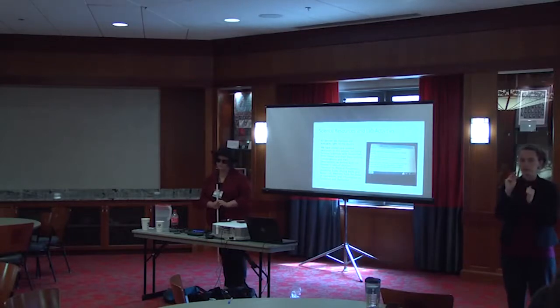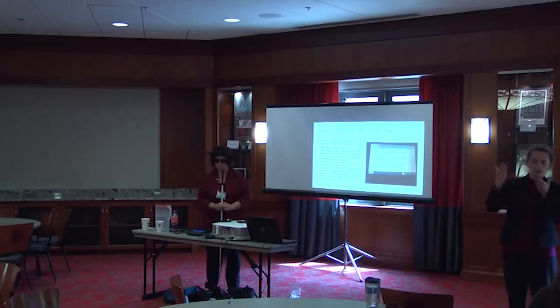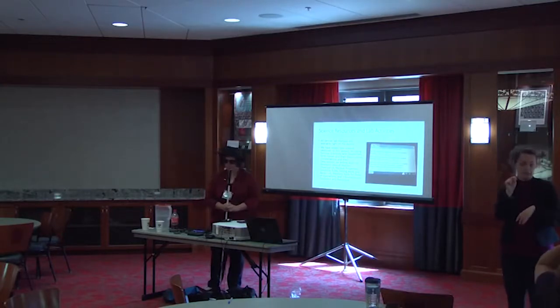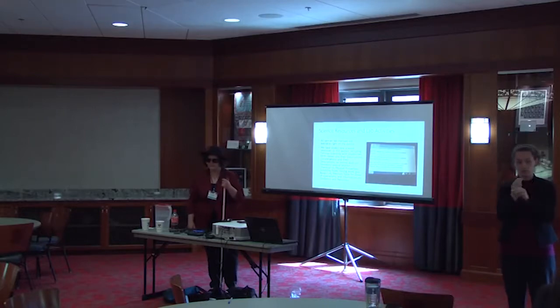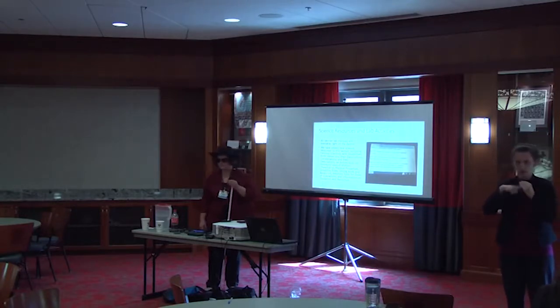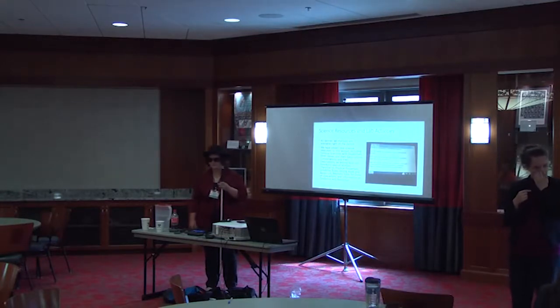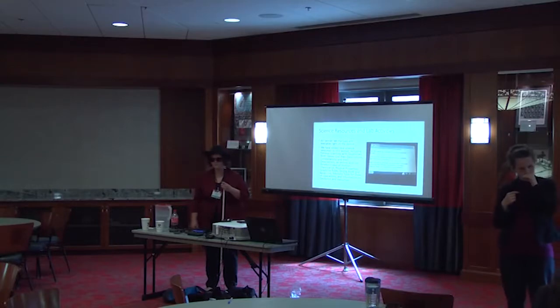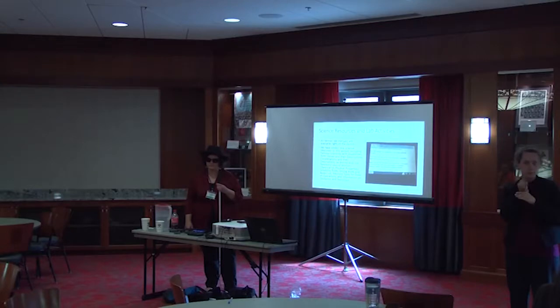That can be useful in order to figure out if you have a timed experiment. If you're saying, I want to figure out what my 15-minute elapse was, it can help me check the time really quick there. And then we just have our menu selection, and then our switching back and forth between the main table pages. So pretty easy, relies on the function keys, the escape key. Enter does what enter does, arrow keys. And so it's basically pretty intuitive from the start.